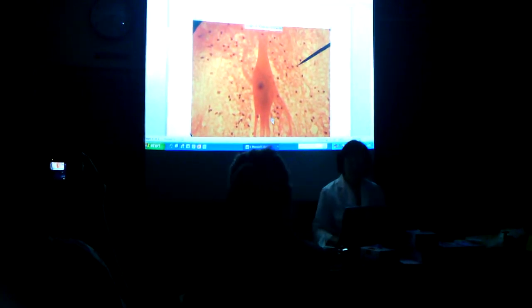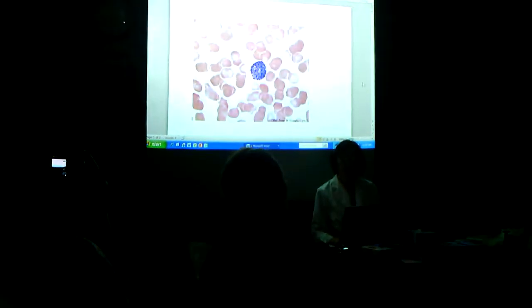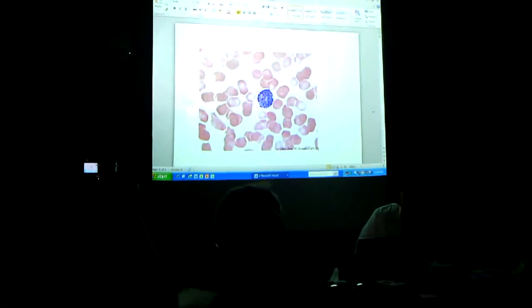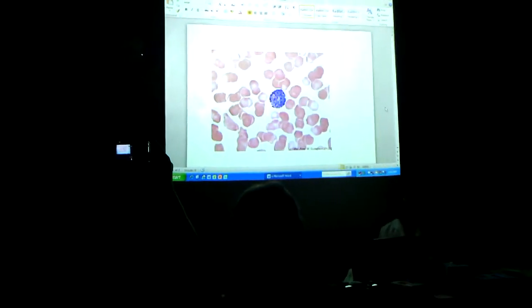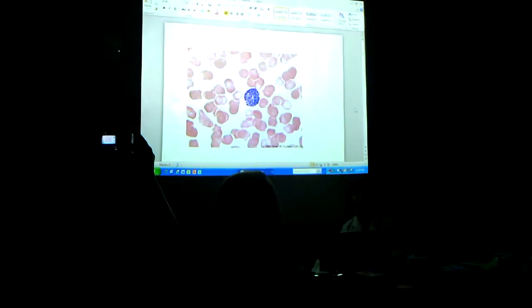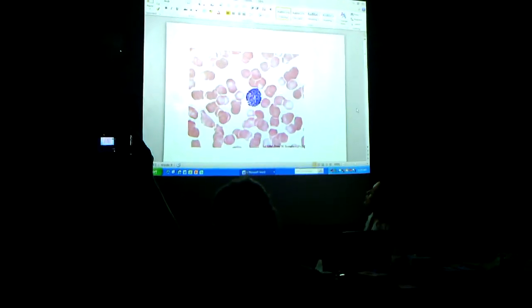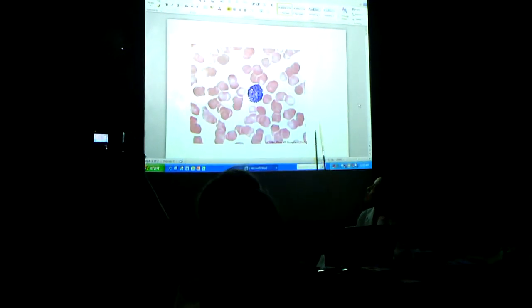We'll go over these in more detail tomorrow. And then the blood smear slide. On there, I only listed 4 because when we were looking at the slides we wouldn't see the basophil. But since we're on the computer, we do see the basophil, so you do need to know this one too. The basophil.